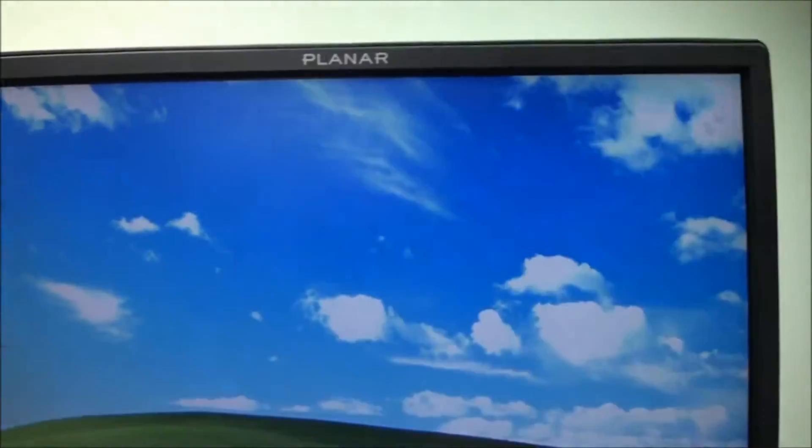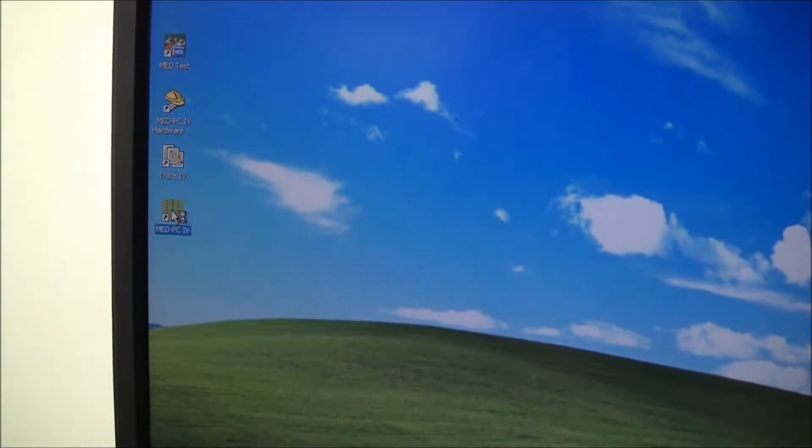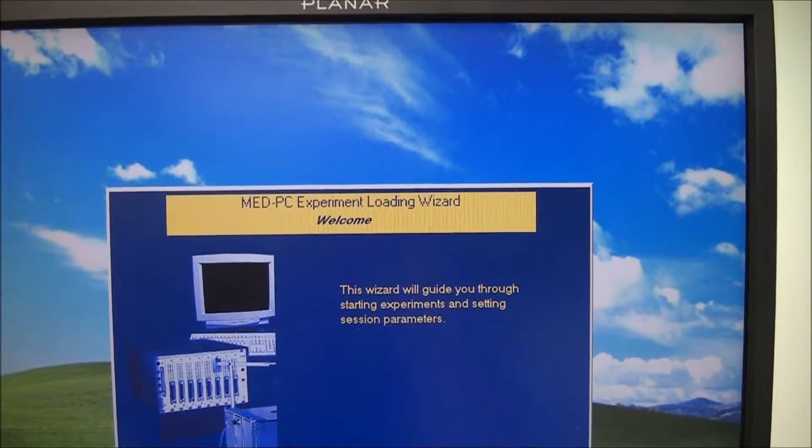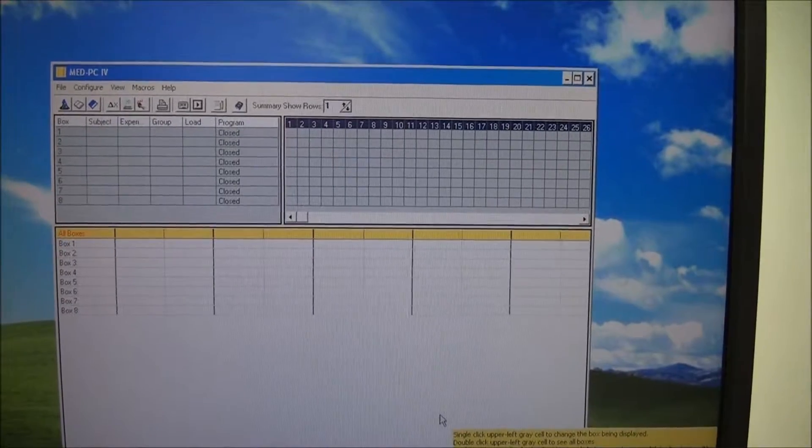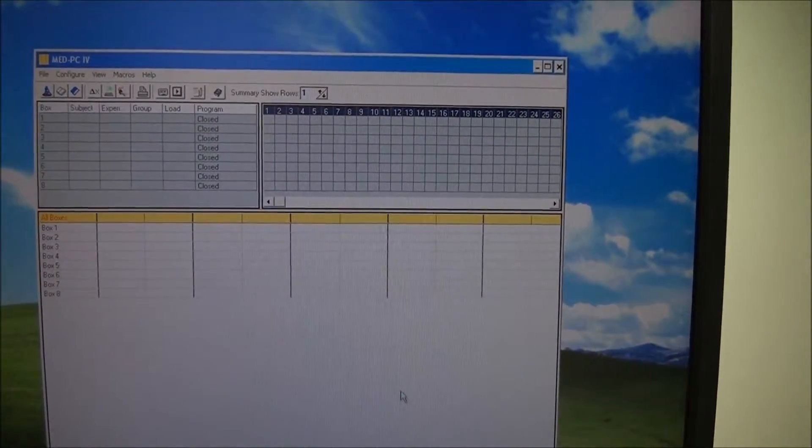I'm going to go ahead and show you the software over here. So we've got MedPC4. There's no programs in here. It's pretty much just blank. This is where you'd start in building your programs. We haven't went that far. We're just basically testing the equipment.